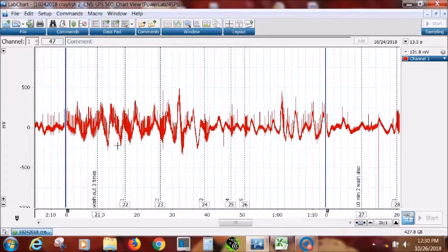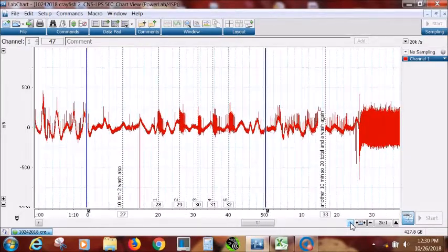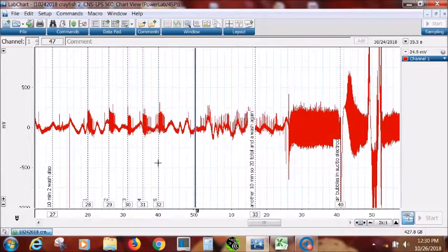So we want you to record the numbers in case we want to plot it 1 through 5, but for some of the analysis we might just average the overall activity. So anyways, we'll collect all the data and have it in a spreadsheet. And then we wash it again after 10 minutes, switching out the saline again and flushing it out over the ventral nerve cord. And here's a nice recording of 1, 2, 3, 4, 5.